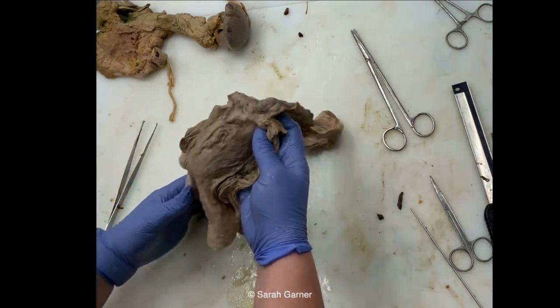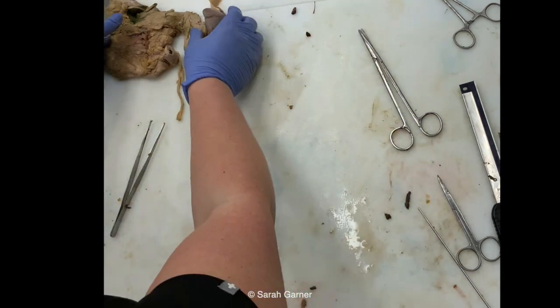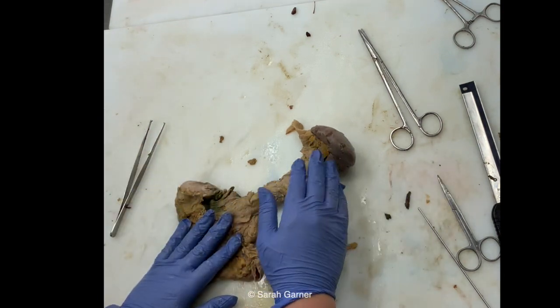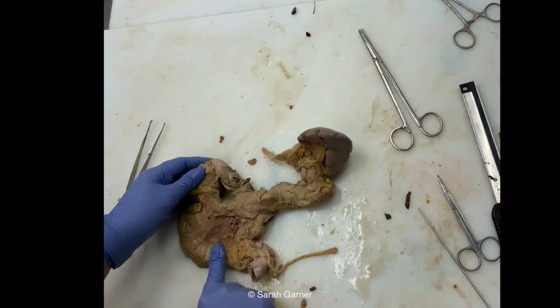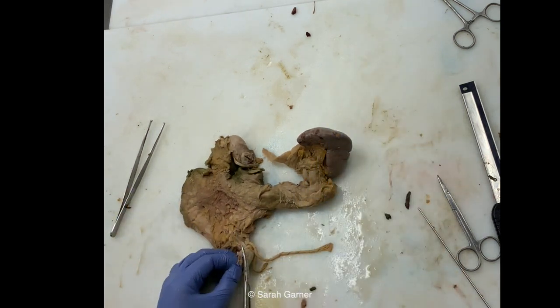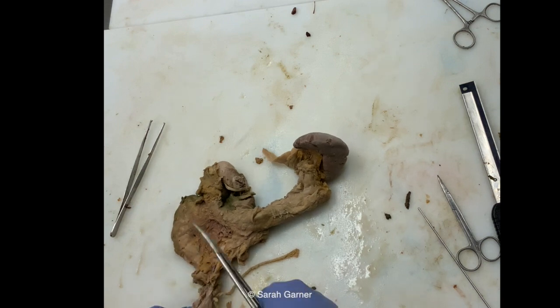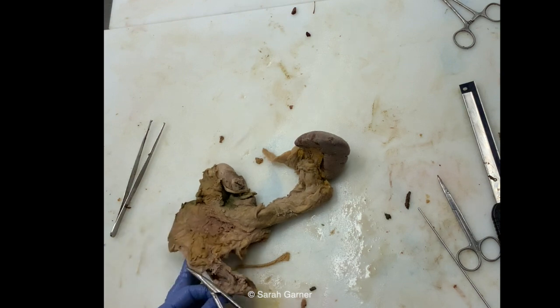So sections are going to depend on your institution and whatnot, but typically you'll submit a section of the GE junction. And then the last part of the abdominal block here is basically like a Whipple. I mean, we have the spleen and pancreas on here still too, but we basically have the very end of the stomach, duodenum, pancreas. So with this, like I said, I like to tell people to practice with their Whipple technique. So you can go ahead and open this, cut through our tie here. You want to open it like along here, along the side, away from the pancreas.